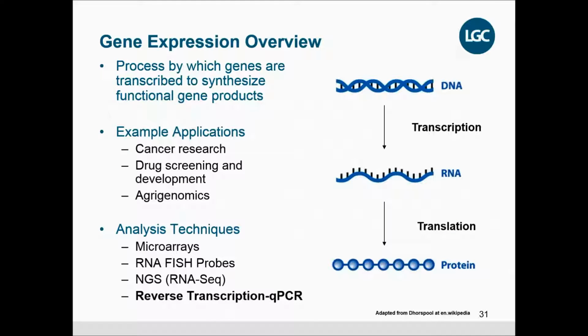So I'm going to switch gears a little bit and now get into gene expression using BHQ probes. Just a quick summary of gene expression. It's the process by which genes are transcribed to synthesize functional gene products.